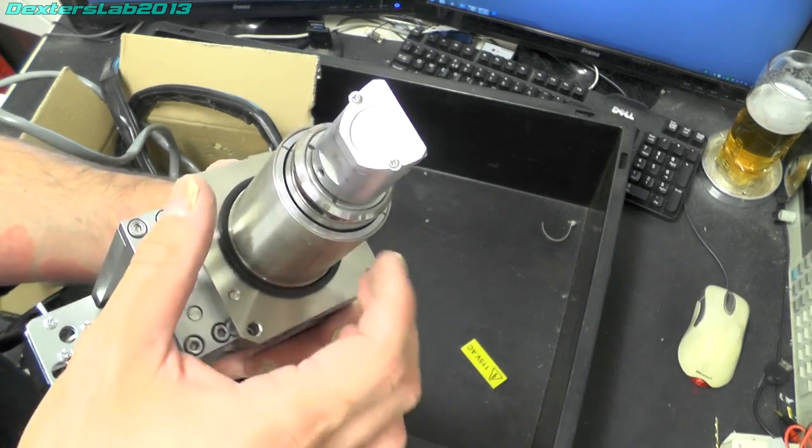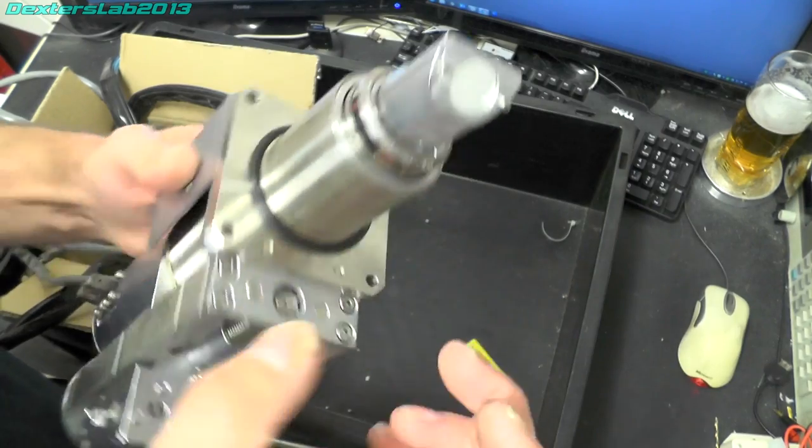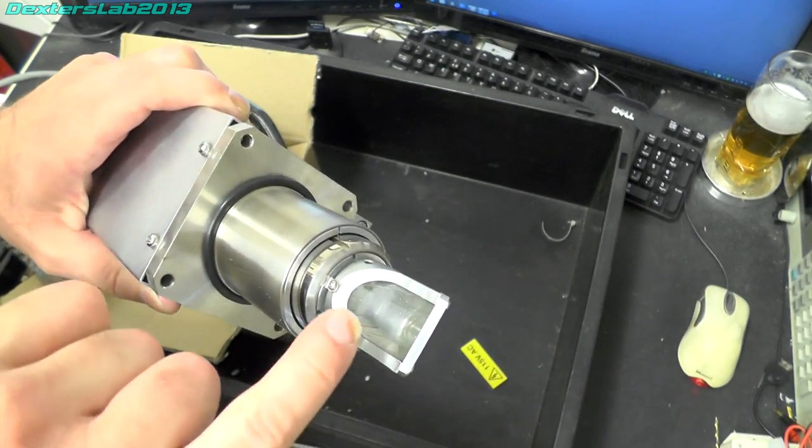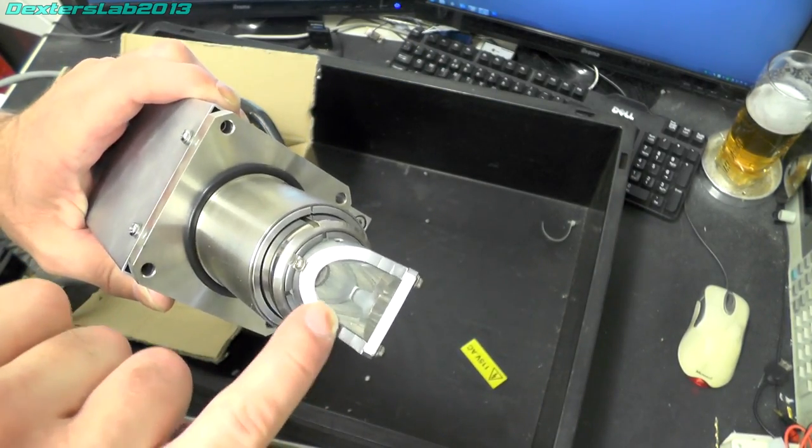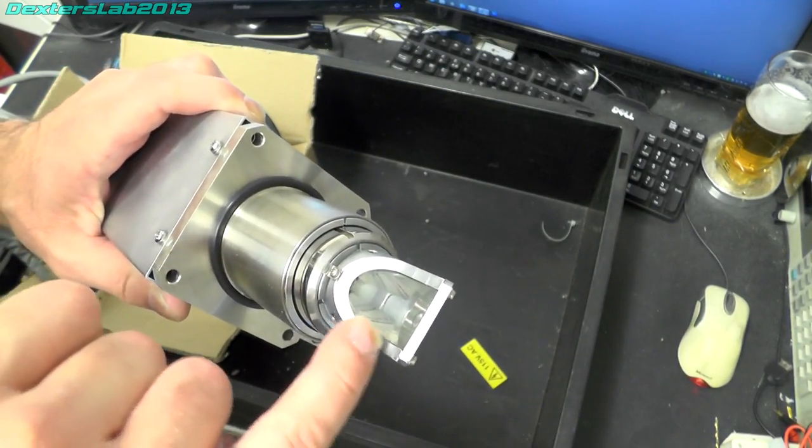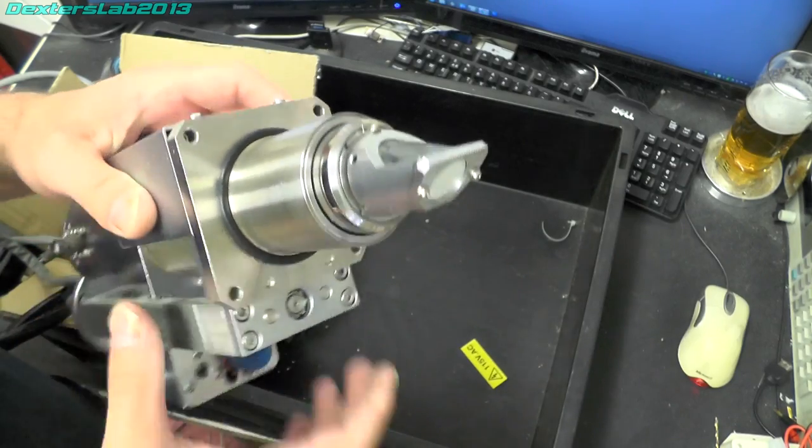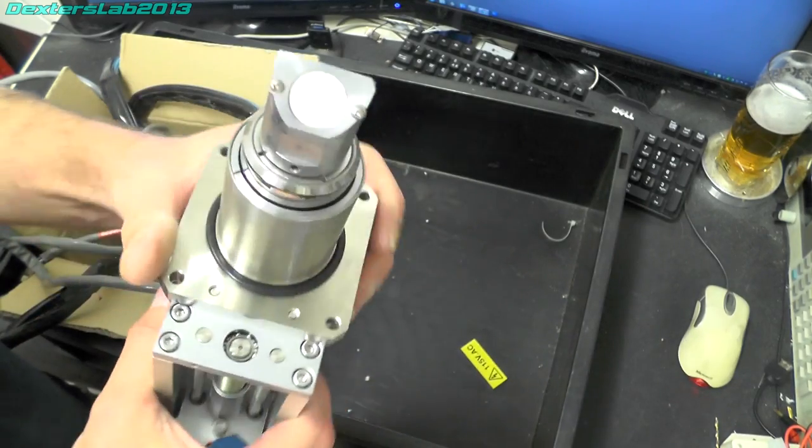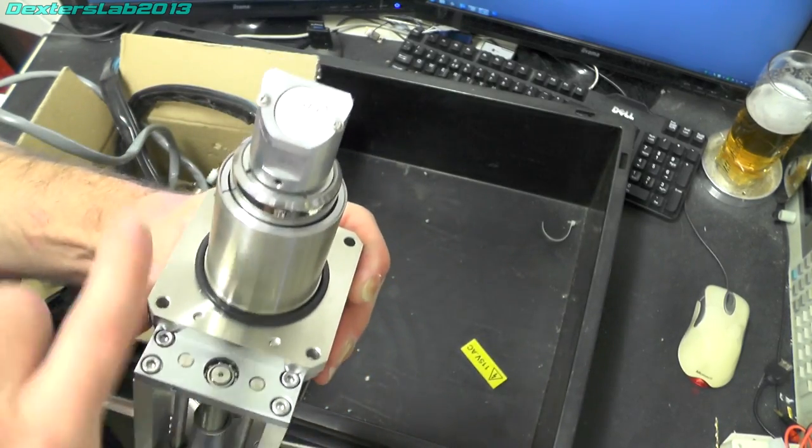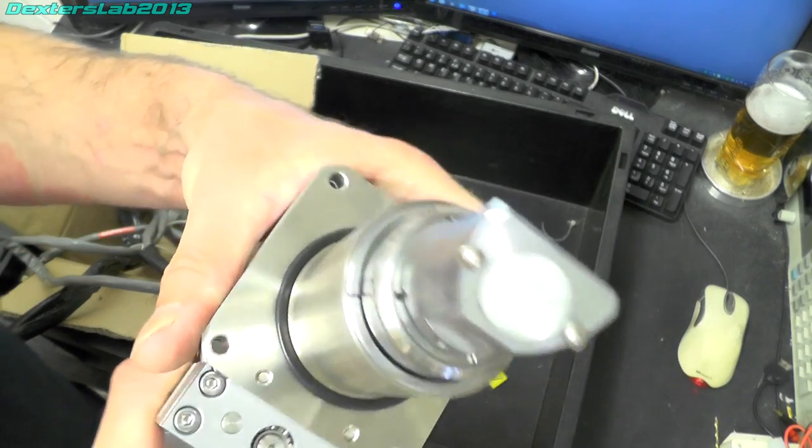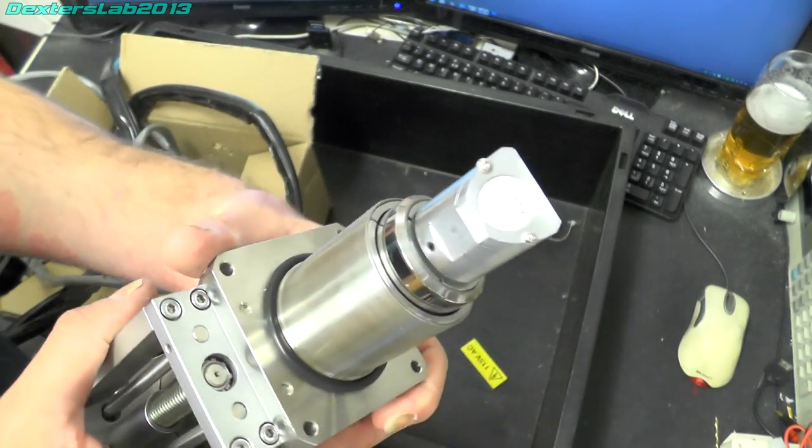But we've got a window on the end and we have what looks like a plastic light pipe which runs down onto the inside. There's some kind of coating on the front there and it does actually have some damage on it.